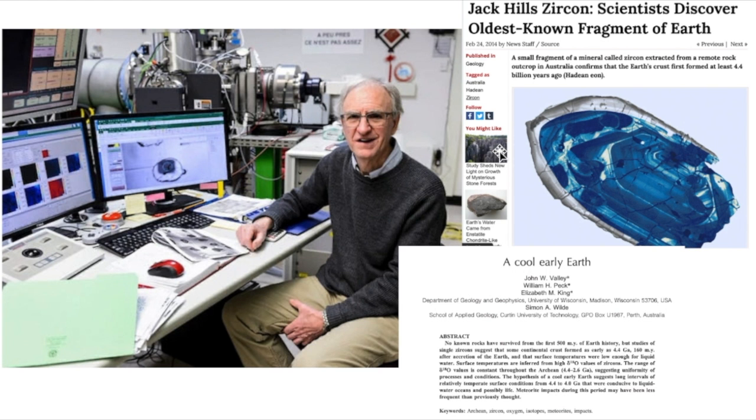All right, I just want to conclude by letting you all know that the SIMS is actually responsible for giving us the oldest known fragment of Earth. So this is Professor John Valley. He is the PI of the WISC-SIMS lab, and here he is measuring a zircon grain from Jack Hills, Australia. And this zircon provided us with the oldest known age of a rock fragment of Earth because the SIMS was able to measure the core.